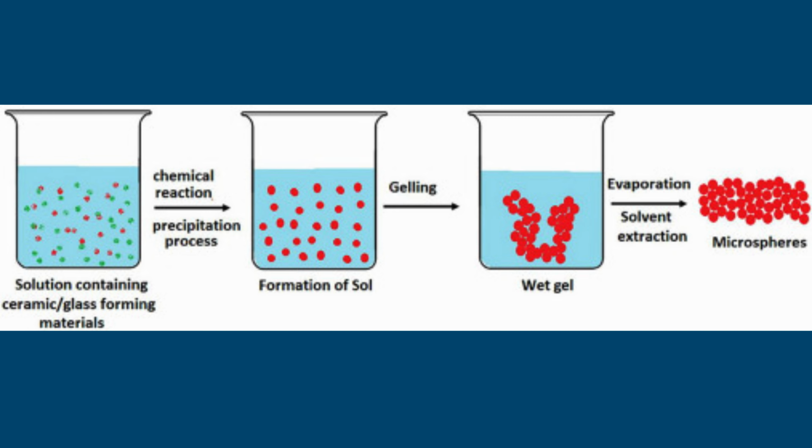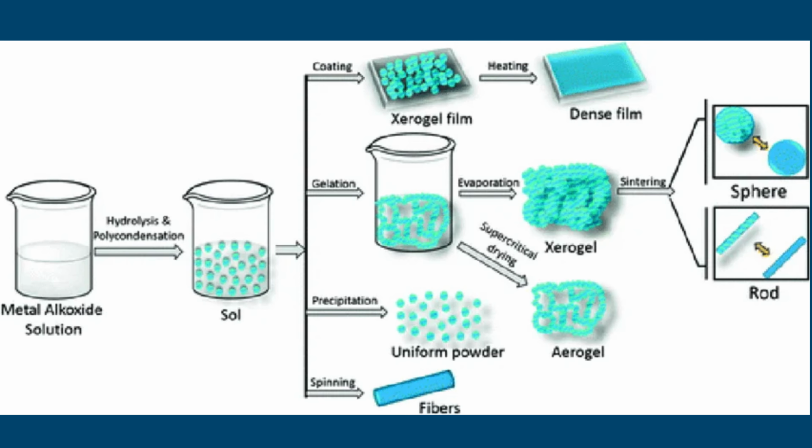In conclusion, the Sol-gel method remains a powerful and adaptable approach for nanoparticle synthesis. The experimental demonstrations of cerium oxide and lithium iron phosphate synthesis highlight the method's versatility and its compatibility with complementary techniques such as hydrothermal processing. Continued optimization of reaction parameters and scale-up strategies will further expand its applicability in advanced materials and energy technologies.